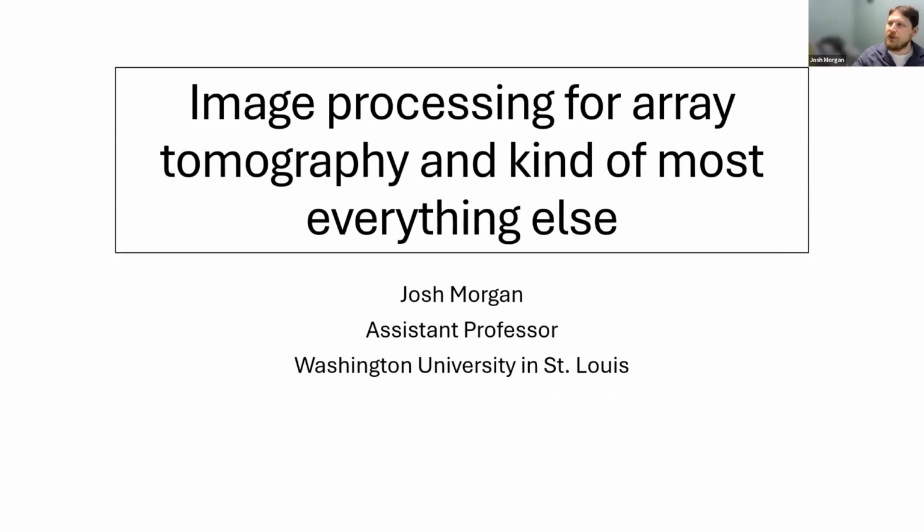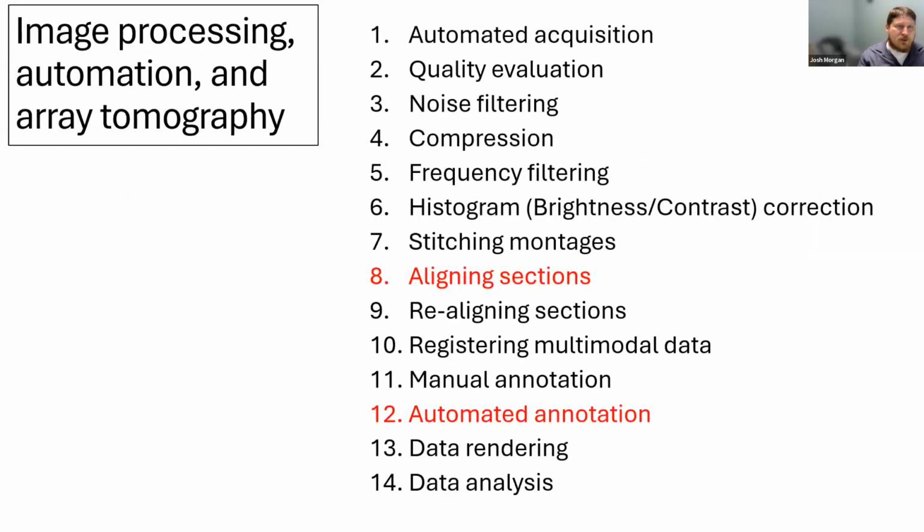So what I'm going to be talking to you about today are some of the image processing steps that make array tomography, at least for large-scale EM, work well. And what I'm imagining as the audience is people who have some experience with EM and this kind of imaging, but are wondering about scaling it up from 2D to 3D or large 3D volumes.